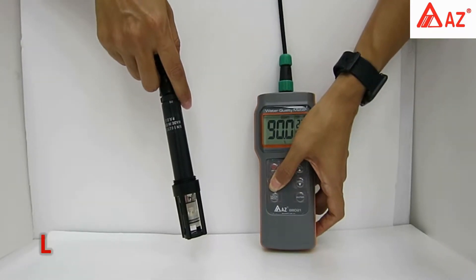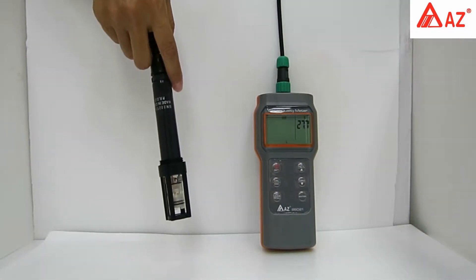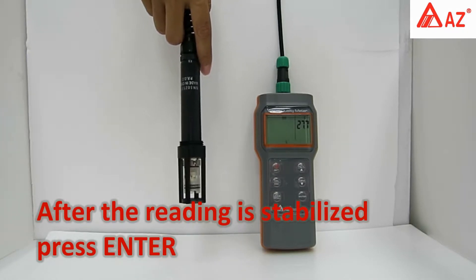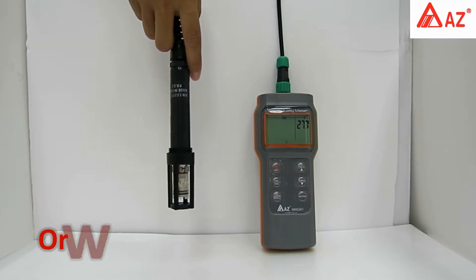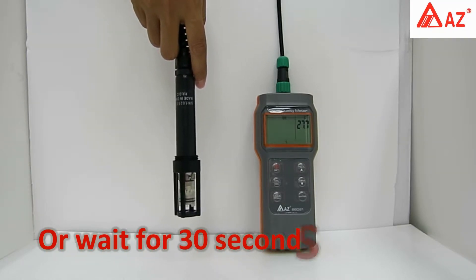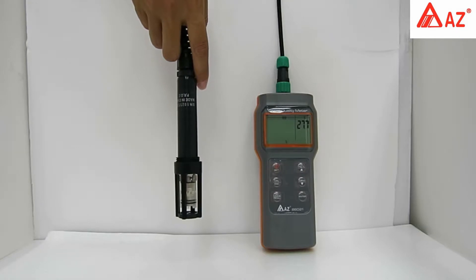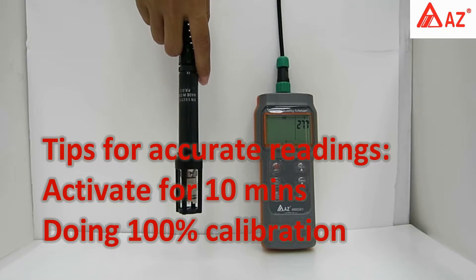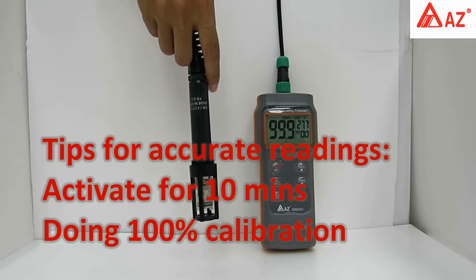Hold the DO probe in the air and long press Cal until the Cal icon appears. After the reading is stabilized, press Enter or wait about 30 seconds. A save icon appears when the result is automatically saved, and it returns to measuring mode. Remember to activate the electrode for 10 minutes and perform a 100% calibration to get accurate readings.